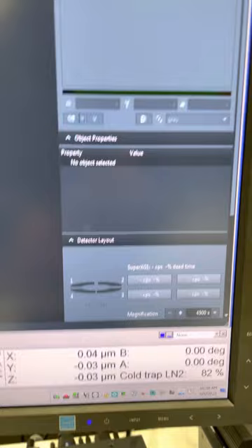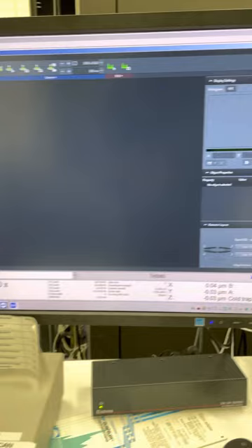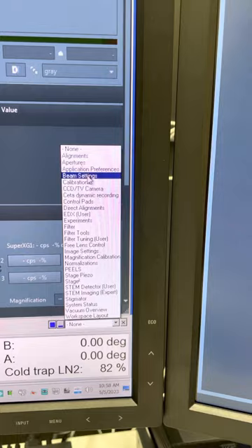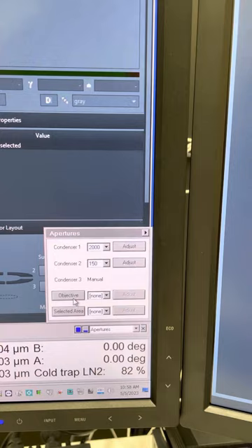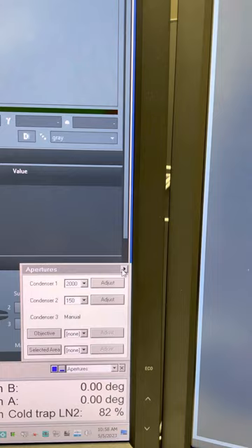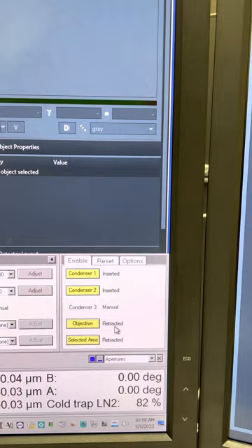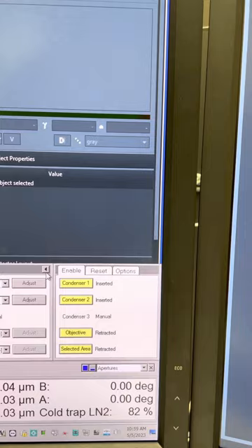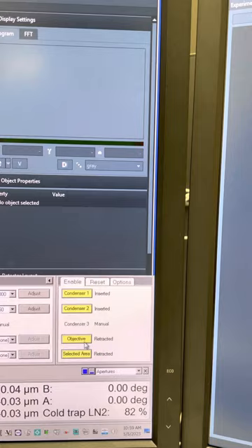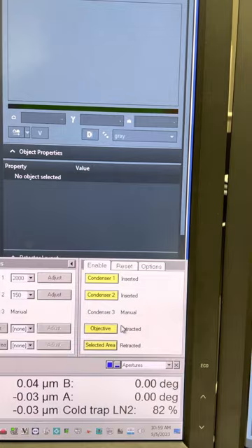Also make sure the objective aperture is retracted. If you see in the user interface at the right bottom corner, click this little arrow here and then click apertures. You see objective is gray, which means it's not inserted. But in order to double check, you can click this arrow here with the flat out button. Make sure the objective is yellow and reads retracted. The most critical is the objective aperture because it sits right below the specimen holder in a very constrained space.